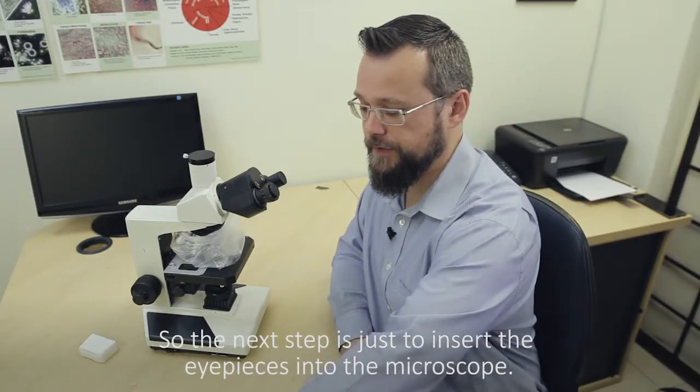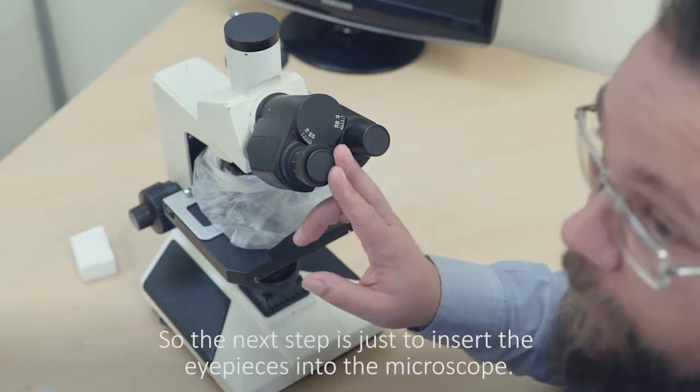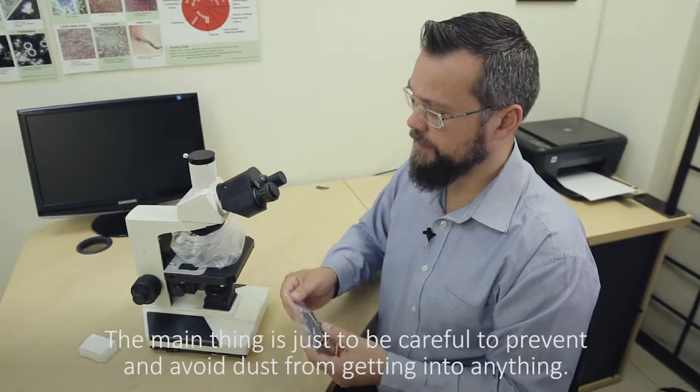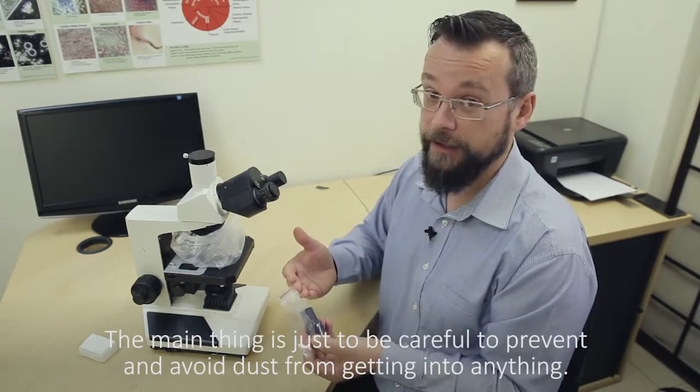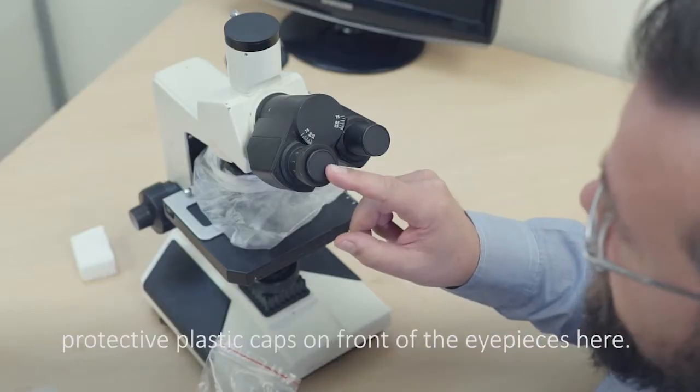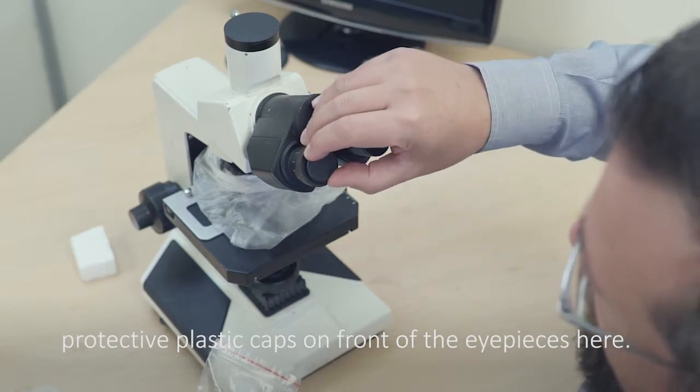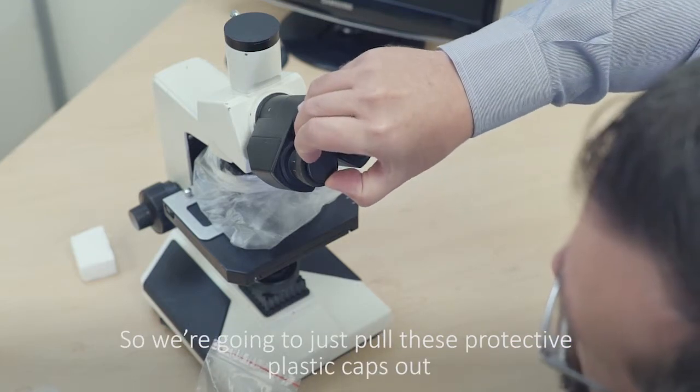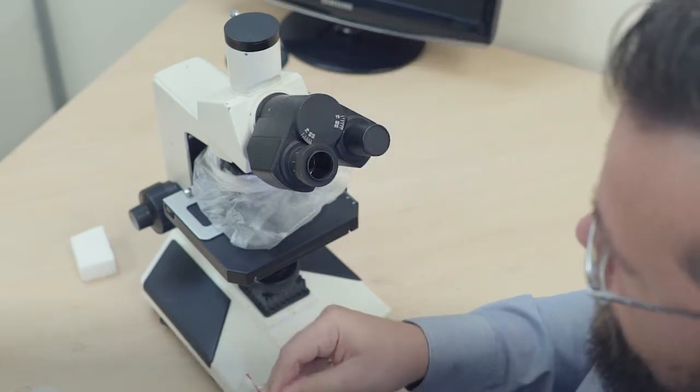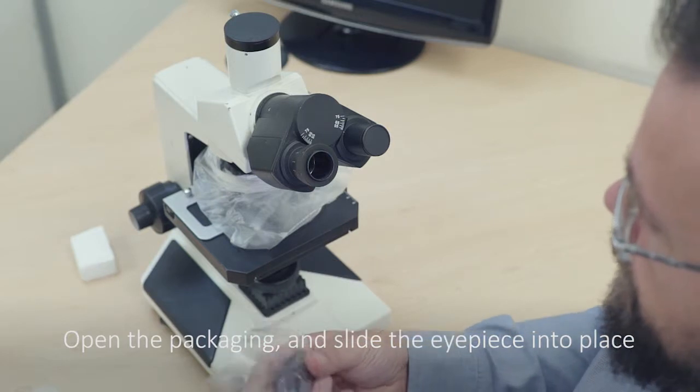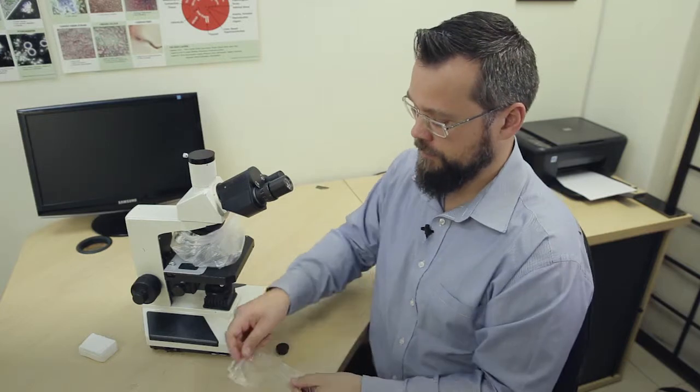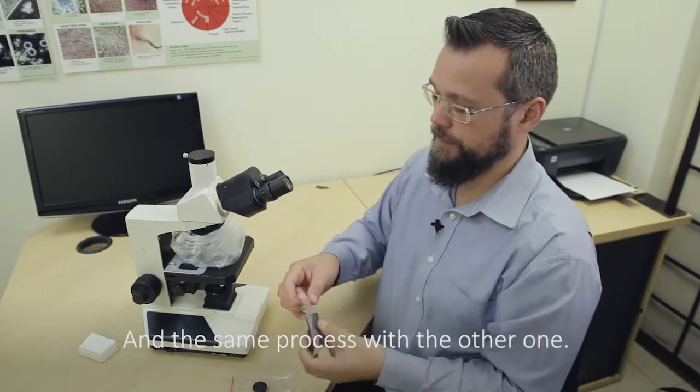So the next step is just to insert the eyepieces into the microscope and this is quite simple. They really just slide into place. The main thing is just to be careful to prevent and avoid dust from getting into anything here. That's why they're still sealed in the packaging and there are protective plastic caps on the front of the eyepieces here. So we're going to just pull these protective caps out, open the packaging and slide the eyepiece into place, and the same process with the other one.